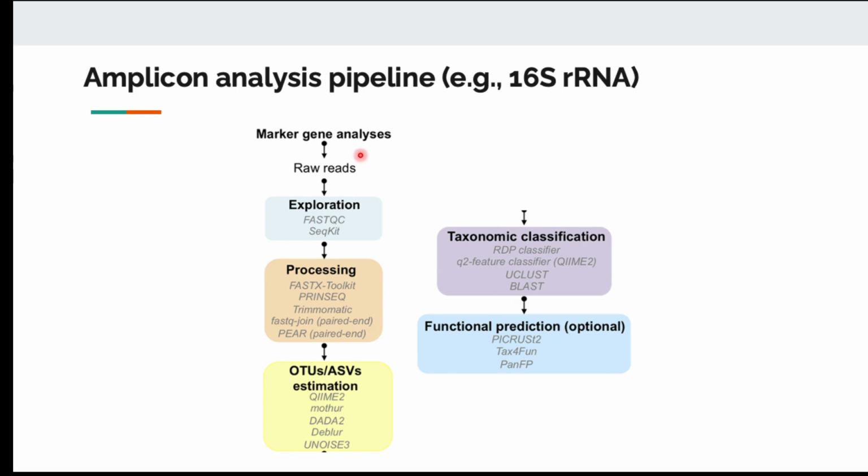So one limitation of analyzing amplicon sequencing data is you know the ribosomal RNA, so you know the taxonomy of your bacteria. But you don't know anything about the other genes that bacteria may have. You don't know the plasmid, you don't know the rest of the chromosome. But sometimes people want to be able to interpret a change in taxonomy between your patient and healthy samples. In healthy people, you might see a change in certain bacteria.